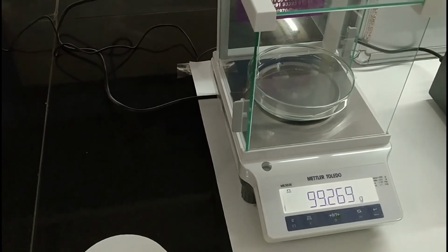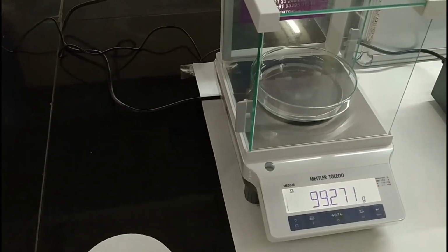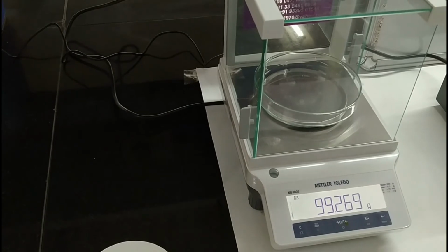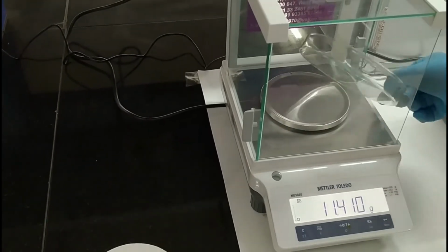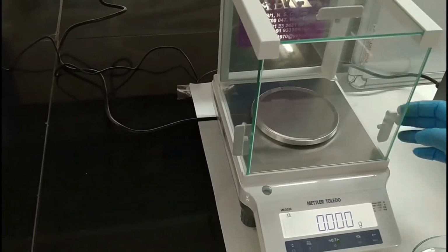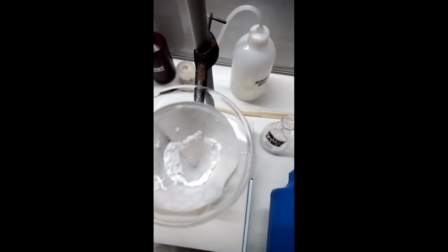Now what is the weight of this petri dish? 99.269. We have to wash this with ice cold water.